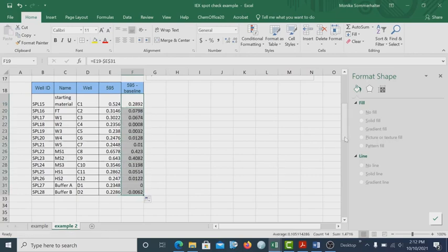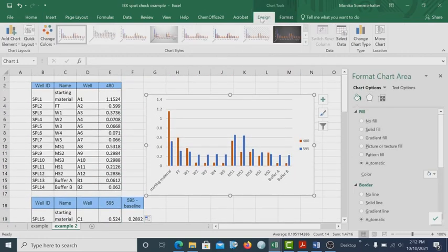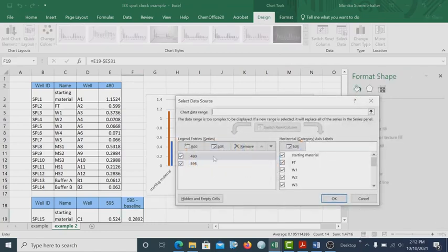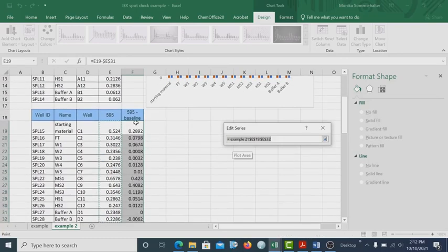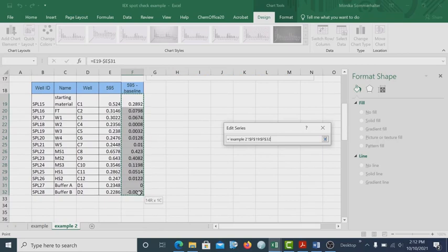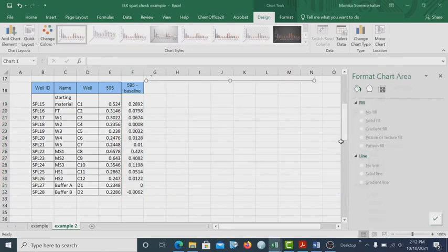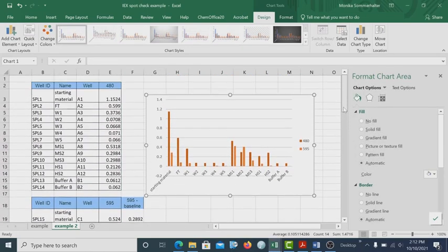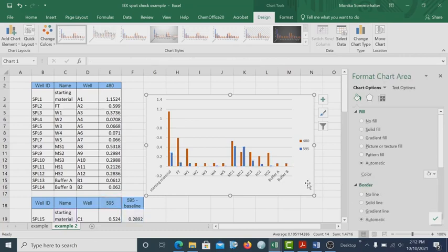move down. What I can do now is switch what I displayed. So under Design, you can select your data again. I'm going to edit what I selected for this data set and move the selection one over. The color unfortunately changed again. So the fill should be solid and in a blue color to be a better match for the Bradford signal.